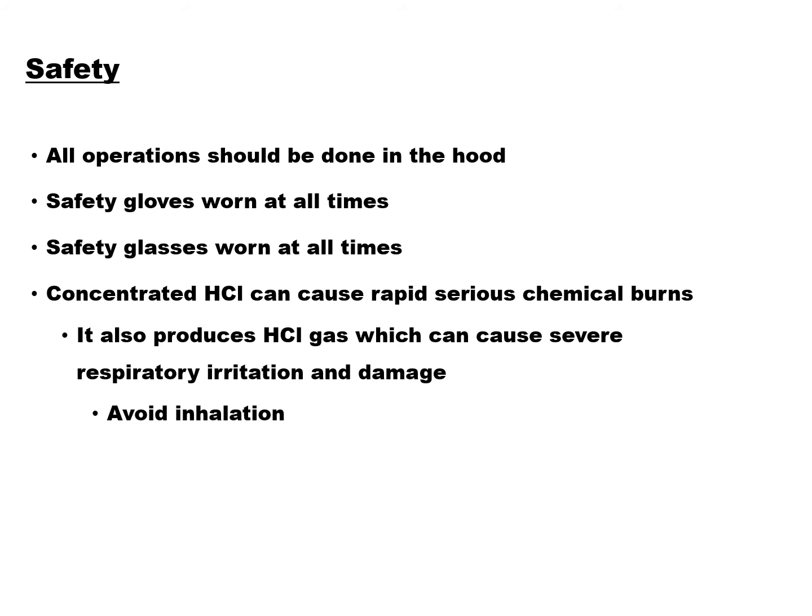In this experiment, we will be using alcohol and acid. Both of them should be handled with great care. The acid, hydrochloric acid, is one of the strong acids, and let alone when it comes in contact with our skin, the vapor that comes from the containers of this acid can cause severe respiratory irritation and damage.